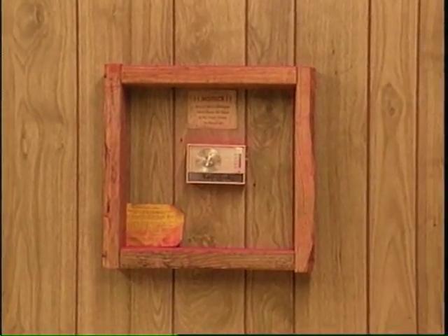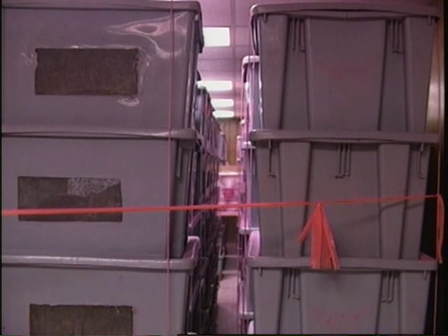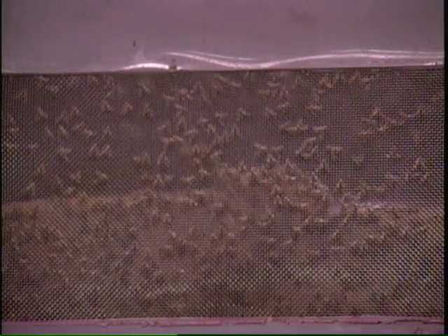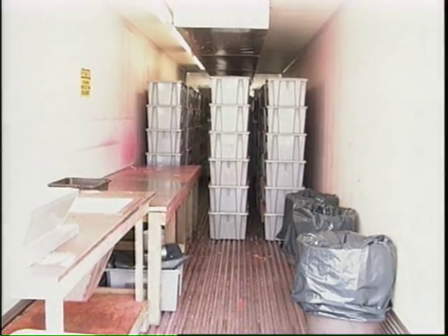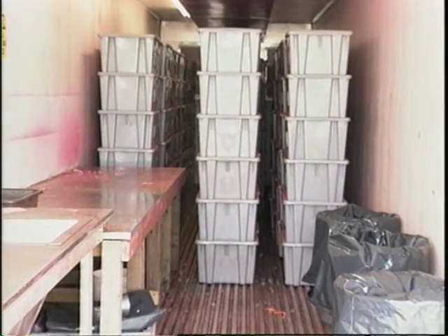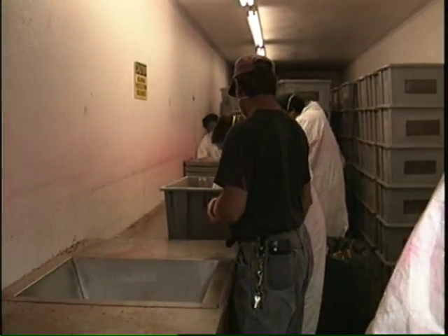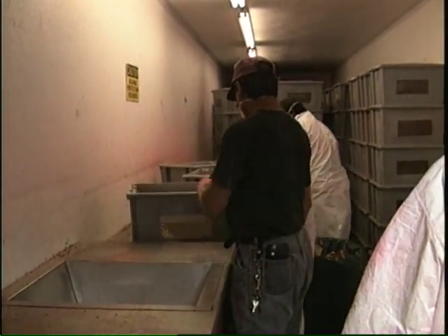After each incubation trailer is filled with boxes, the thermostat is set at 77 degrees Fahrenheit, fans are set to the on position, and the lights are turned off. The fans will allow for proper air circulation throughout the trailer to prevent temperature inversions. As Medflies emerge from their pupal stage, they crawl up the sides of the paper bags inside the boxes then fly to the top of the box to feed. The Medflies are kept in this incubation trailer for four days. After four days of incubation, the adult Medflies are transported in the boxes to a refrigeration trailer in preparation for the collection or knockdown phase. Here, the flies are chilled to 38 degrees Fahrenheit for approximately 30 minutes. At this temperature, they're completely immobile and can be manipulated.